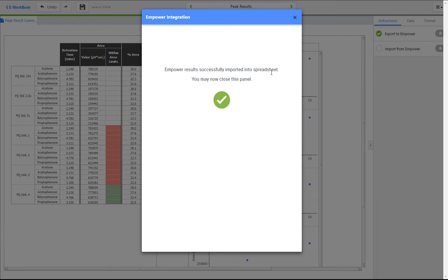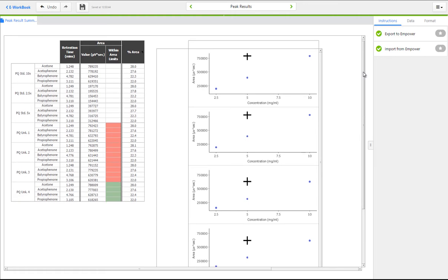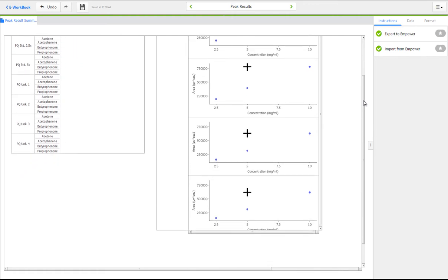Once the results have been imported, the eWorkbook spreadsheets can be used for further data processing or charting of data.